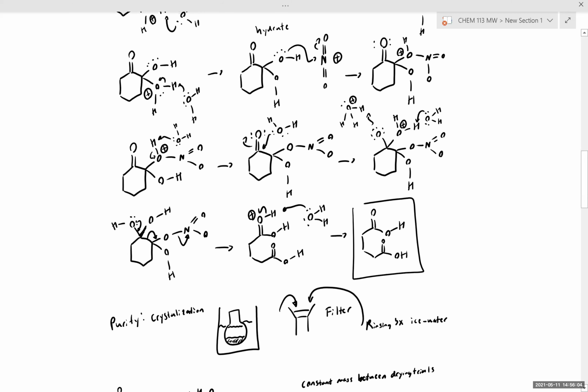We're adding the cyclohexanol very slowly, because if the temperature gets out of hand, we can end up with a runaway reaction and then the sample will escape from the flask. So in the lab, you're often adding it very, very slowly and closely monitoring the reaction. You'll notice from the recording, when I add a drop of cyclohexanol, the mixture immediately starts to vigorously bubble.